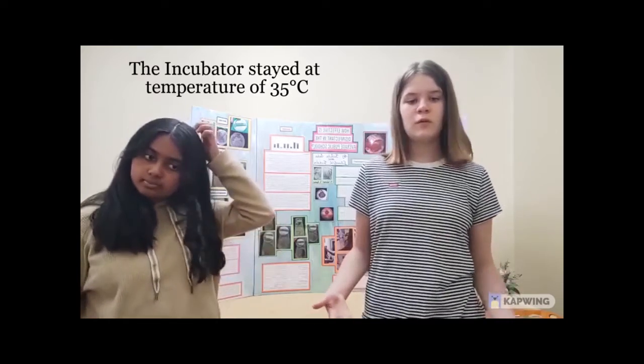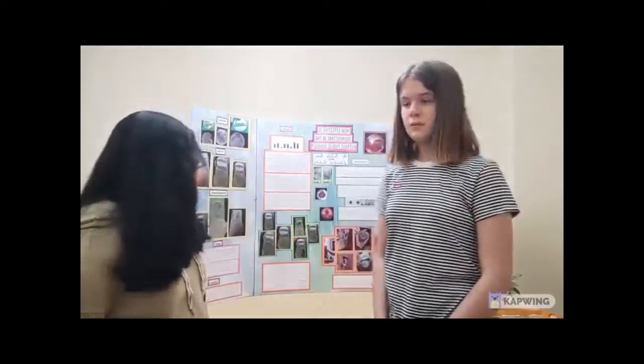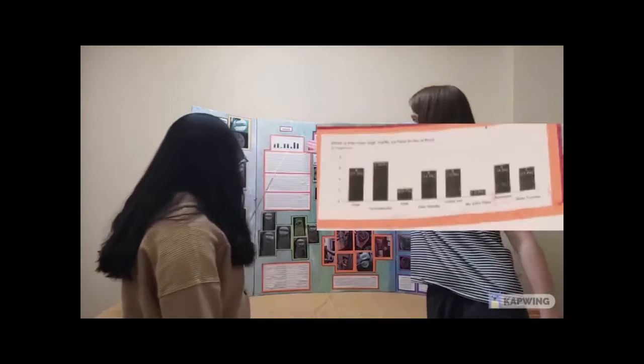We put our thermometer in and tested how close we need to have the lamp to the incubator for it to be the right temperature. The incubator stayed at a temperature of around 35 degrees Celsius. The next stage was swabbing. This was pretty simple. We went to the suggested places from our survey, as seen here.